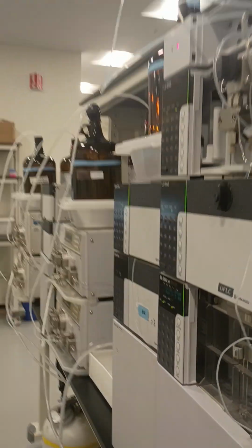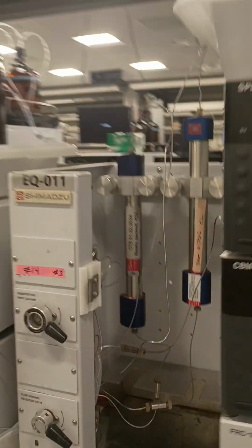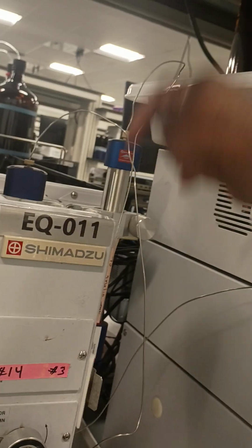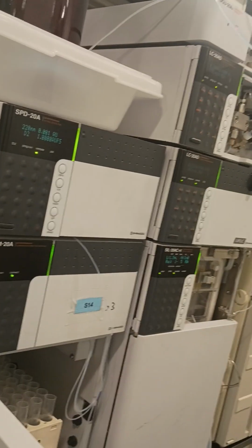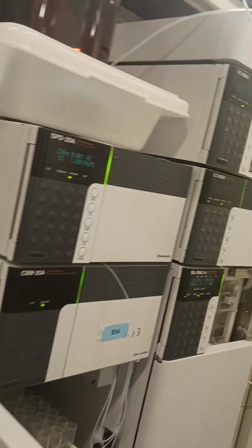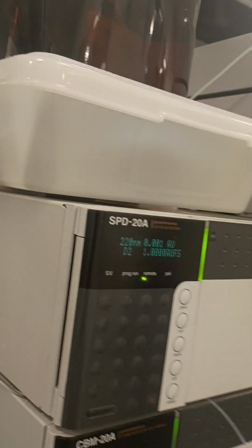Once I get my peptide, I run it, and then I recover everything it needs. This is the column, so I shoot it here, it goes through the column, and these are the mobile phases. This pushes it through the column, and then it separates. There's a program that already tells it to separate by mass and affinity, so it knows what to do. Then the detector sees the actual peptide that I need, and they start dumping everything into these little tubes. At the end of the day, when I collect, I'm ready to shut it down.